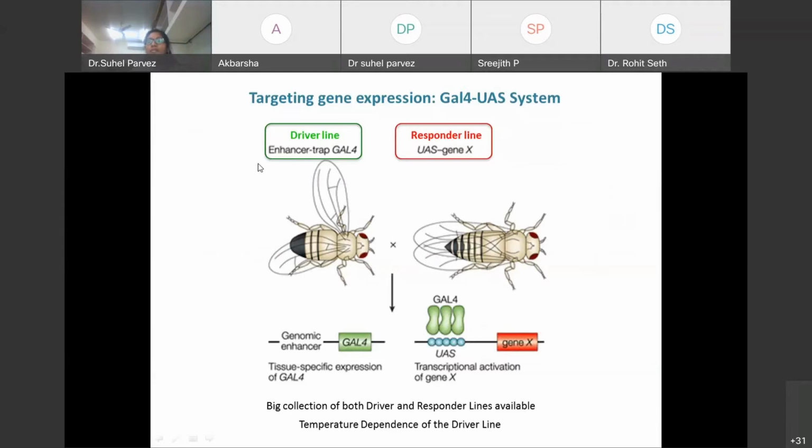So how do we make transgenic flies to study our gene of interest? In Drosophila, we use the UAS-GAL4 system, where UAS stands for upstream activating sequence and GAL4 for galactose 4. It is generally used in yeast, and it works in Drosophila. We create transgenic lines with a particular gene attached to the upstream activating sequence in a P element, and this element is inserted at the embryonic stage of the Drosophila by microinjection. These flies then grow to develop as a fly line for the particular gene.